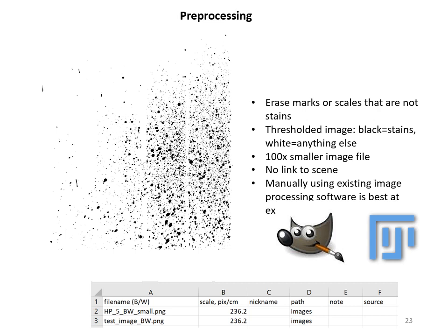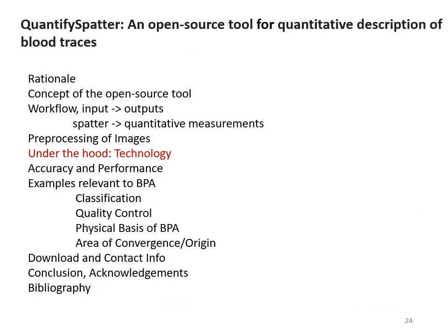Maybe you're adventurous enough to send it to a website in California, and nobody's going to blame you, because I don't see the stairs, I don't see the markers on this picture, I just see bloodstains, right? And then that's the real input of my code. And then there's a spreadsheet where you simply write the list of the pictures you want to process and the scale of these pictures. And you can write many so that the software will process maybe 100 pictures overnight while you go to other activities. So it can work in batch also.